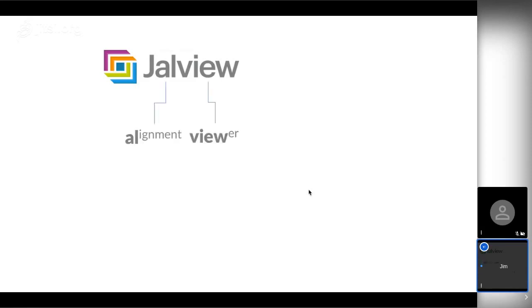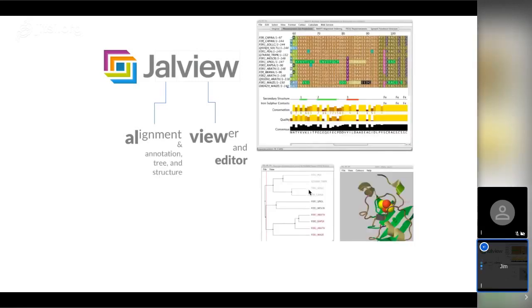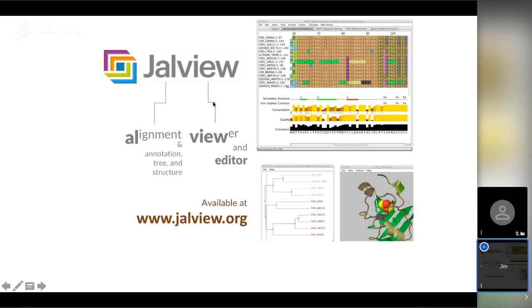A little bit about Jalview — the name comes from the fact it was originally developed as an alignment viewer, but it does quite a bit more than that. It allows you to edit alignments and so on. The key idea is that you have an alignment view, a tree viewer, and a structure viewer. It's available at www.jalview.org, where you can download and run it. There's also a JavaScript version which will probably run on your mobile phone, or on an iPad, and we're currently developing it further.